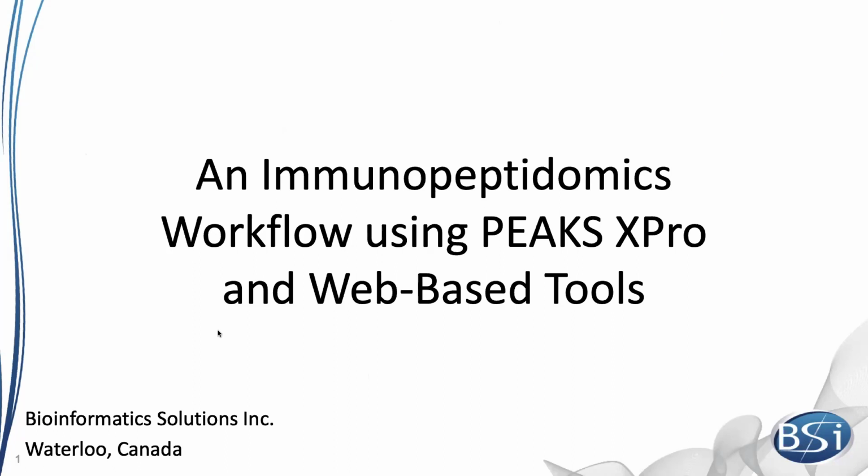Thanks, Catherine. I apologize if some of this is going to be a little bit repetitive. I know we've already heard a couple of great talks in the immunopeptidomics field. But for my talk, I just wanted to highlight the importance of doing de novo sequencing and how PEAKS de novo sequencing can uncover a lot of antigens, HLA peptides that will not otherwise be identified in a generic database search.